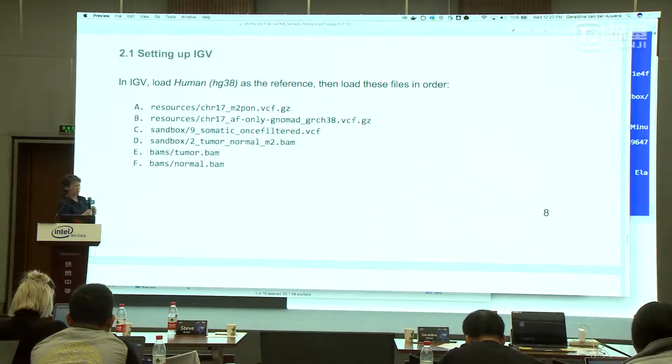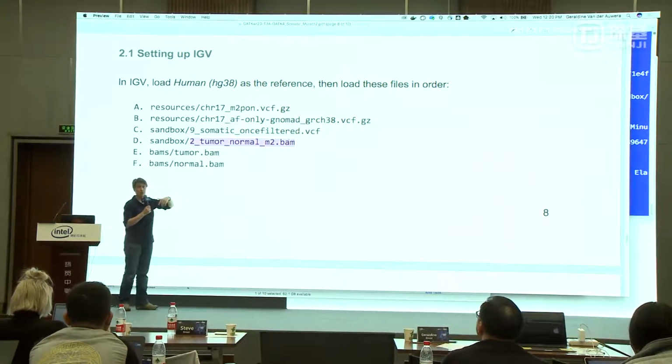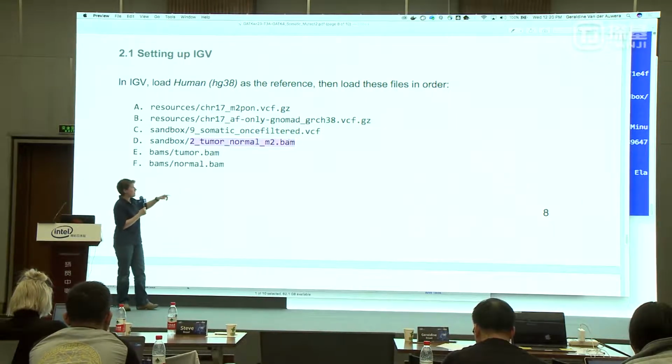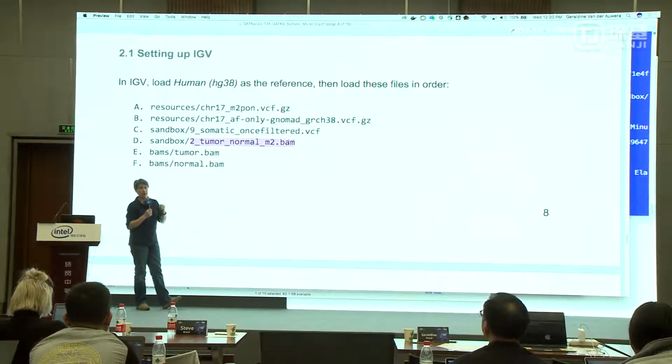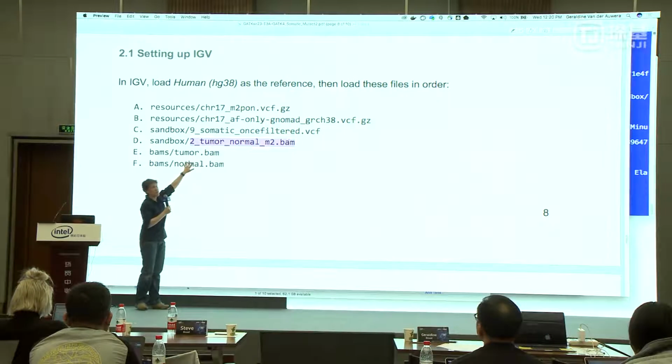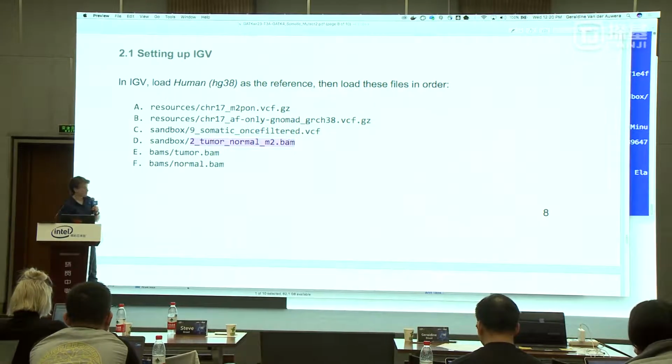But really, if we have the BAM out, that has most of the information we want from a BAM. In fact, it's more appropriate than these two, since, as you remember from the exercise yesterday, this is representative of what the variant caller actually used, as opposed to this, which is the before-assembly state of the data. Okay? So we'll load the two resources, the filtered VCF.